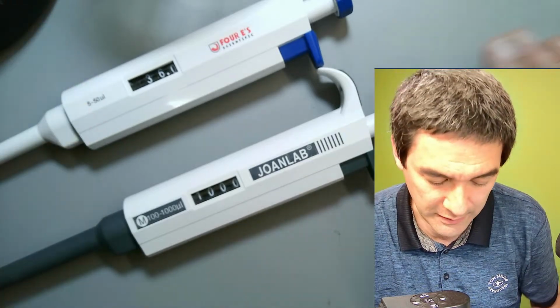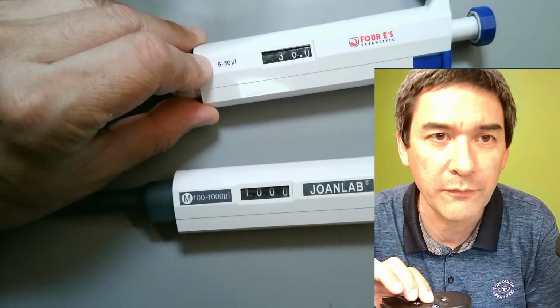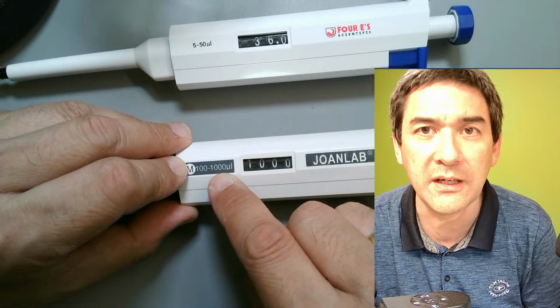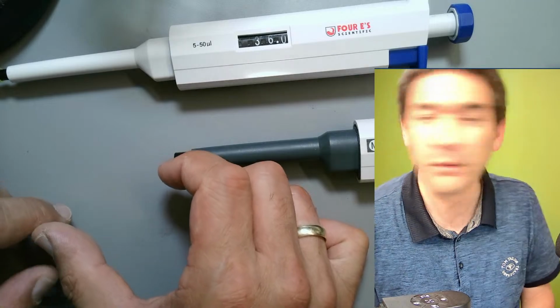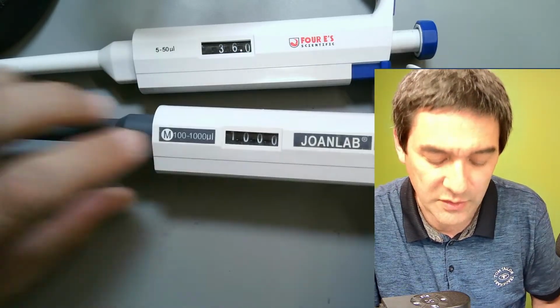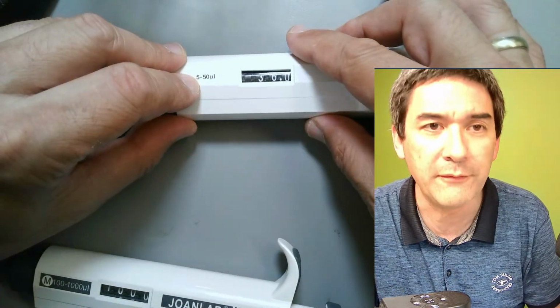Essentially, this one goes from 5 to 50 microliters, and this one goes from 100 to 1,000 microliters, so basically 1 milliliter. The tips are blue and bigger, but I don't have any more. I think the one that goes up to 1,000 is too large, and I'm using the one from 5 to 50.